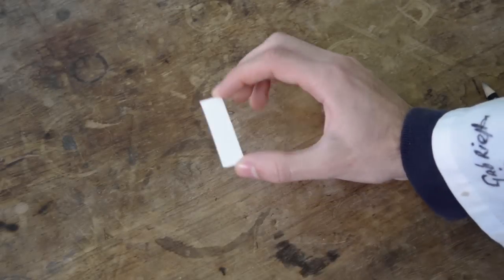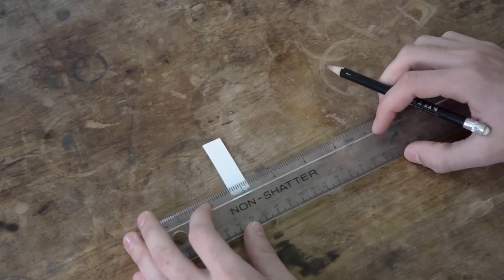Cut the TLC plate down to an appropriate size. Around 6 cm by 2.5 cm should be sufficient.